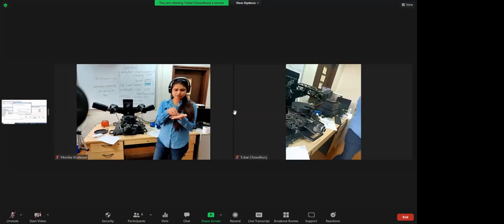Yes, absolutely. Whenever we are doing it for the first time, we are not that sure about our sample. I can suggest what you can do whenever you are making a film: go for different spots, and the data should be within the error. If you are getting the same kind of data every time, then you are sure that the data you are getting is correct for your sample only.